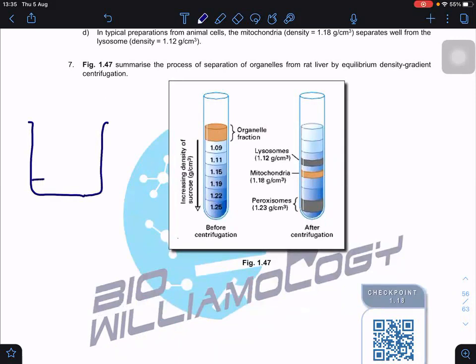Okay, I put the mercury inside here. Mercury, roughly, if I'm not mistaken, has a density of 13. Okay, then I put in here, let's say water, and then a layer of oil. So each of them will have their own density, correct?